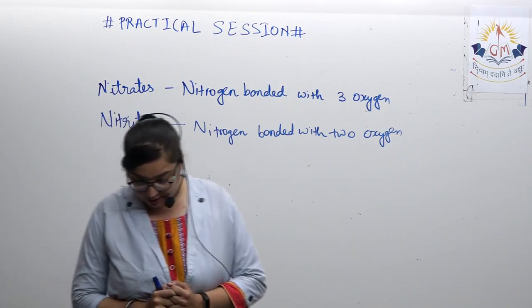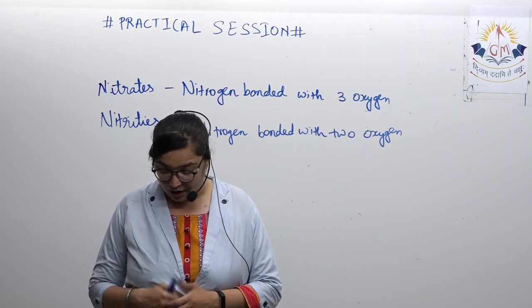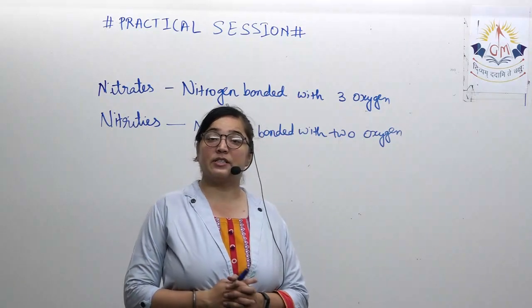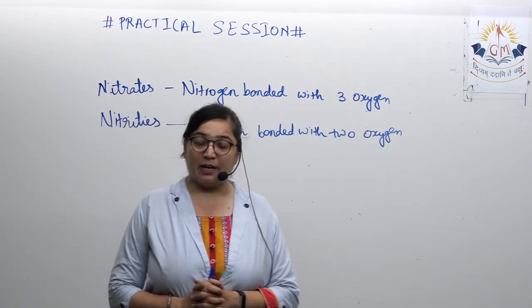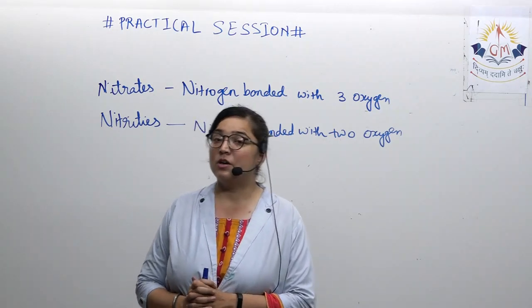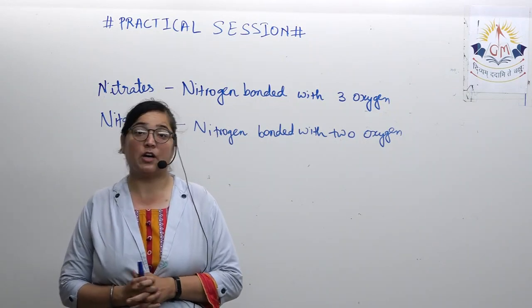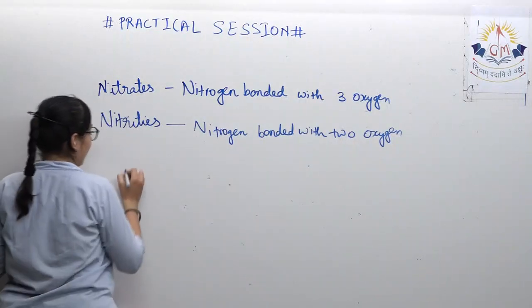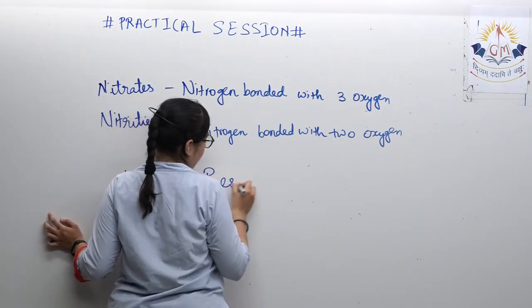Even they are naturally present. We are also consuming it. Yes, we are also consuming some amount of foodstuffs which is containing the presence, because ultimately plants are converting the nitrogen into useful compounds. So in our today's session, we are going to detect the presence of nitrate. Okay, what is our concept for the day? To detect presence of nitrate.